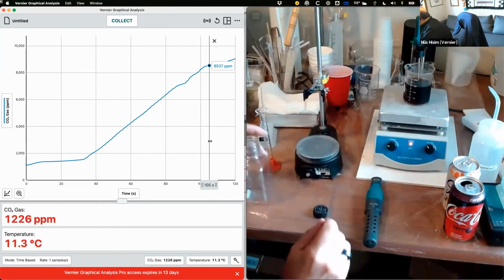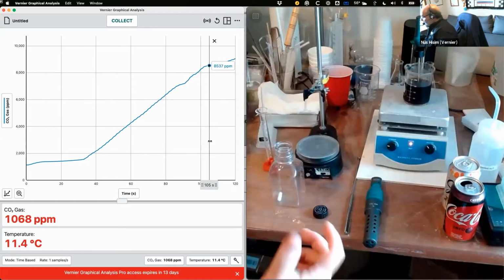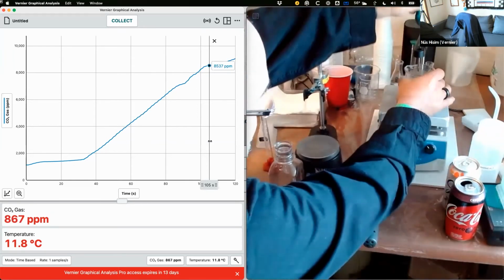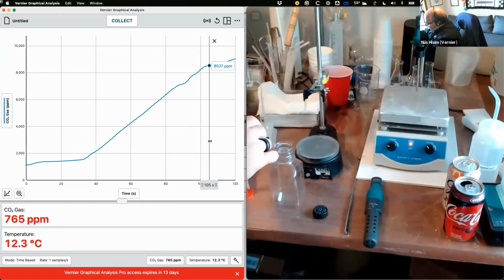All right, let's get my next sample here. So yeah, not bad. 11 degrees, started out at 4 degrees. That's not too bad. Let's take a note of that. 11.7 degrees, we'll call it. Take that sample and we'll get 5 milliliters of that.